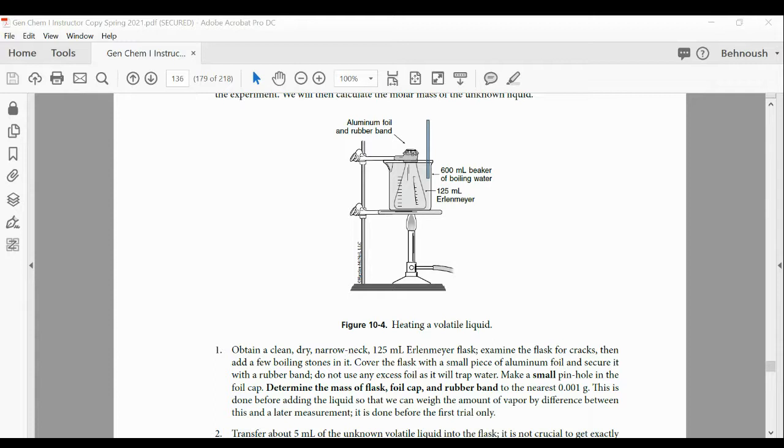So far, we only have the temperature. How do you measure pressure? So everybody's clear what we are measuring for temperature and why we are assuming that is correct. We measure the temperature of the hot water, or the water bath, or boiling water, or as soon as the vapor escapes. At that point, you record the temperature, and you record that as same as temperature of the gas.